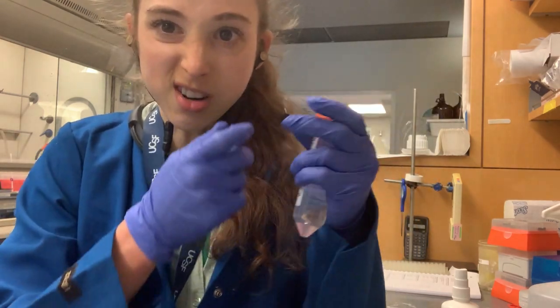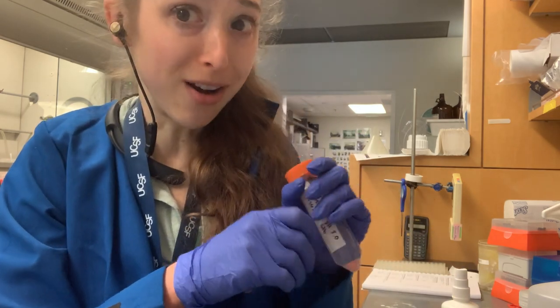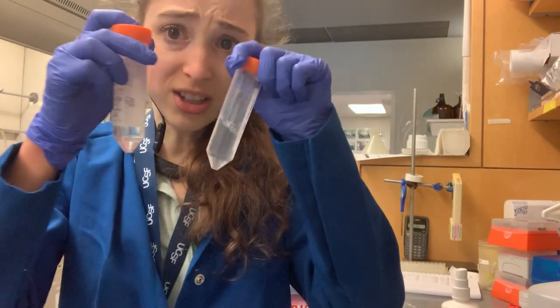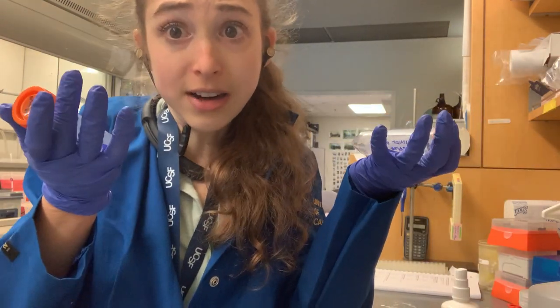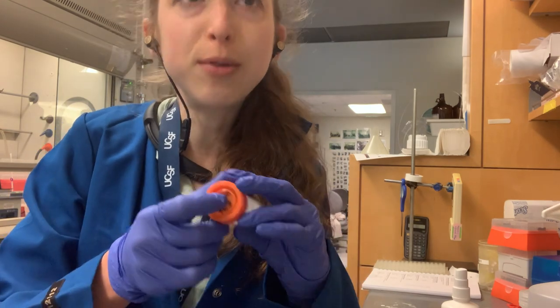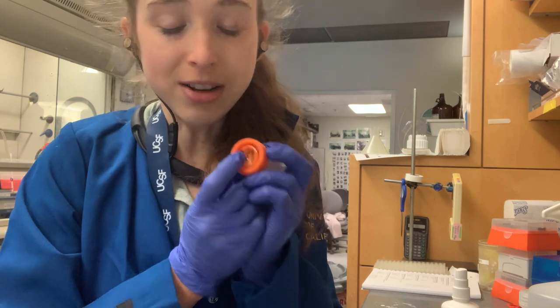It's like when you have those Sharpies and you put the wrong Sharpie cap on. If you have two solutions that look identical, then how do you tell them apart? So what do you put on the tube? Even with a flat tube, especially a smaller flat tube, you can't fit everything on the lid.